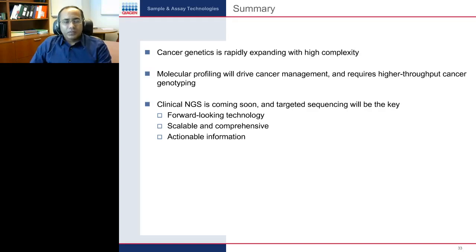Another question is, can the QIAGEN bioinformatics team develop or design panels for non-human targets? Right now we are not exploring that, but it can be done. You can contact QIAGEN technical support or QIAGEN sales staff, and they can help you with that.